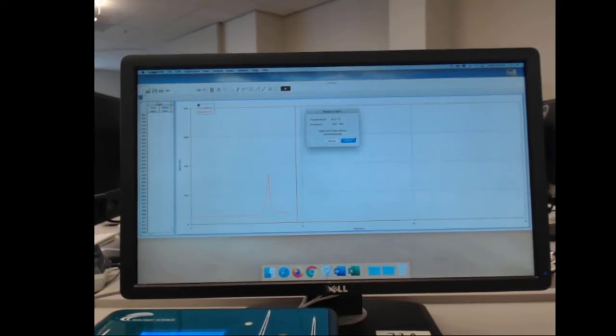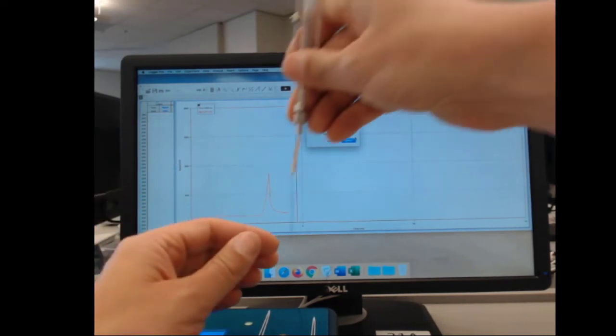Okay. So for our next chemical compound we're going to inject, it will be the 4-methylpentanone. So this compound has a longer carbon chain, which in turn gives it more surface area than our first compound. That larger surface area, since they have the same functional group, is going to be the important difference between them. And we want to see how that larger surface area impacts the interaction with the stationary phase inside of our gas chromatographer.